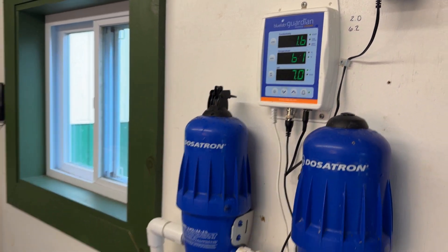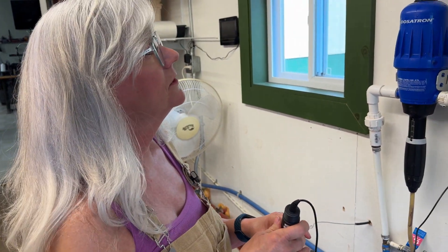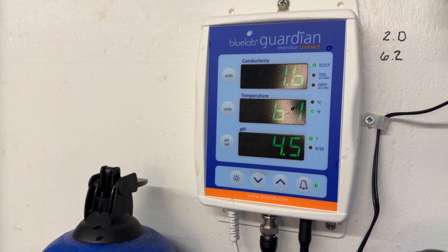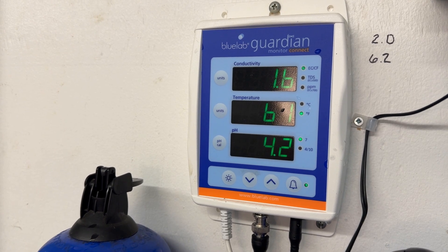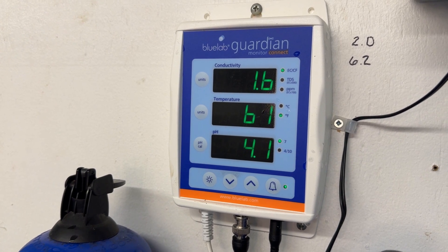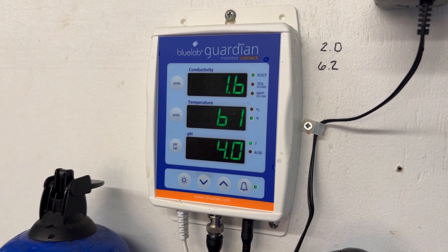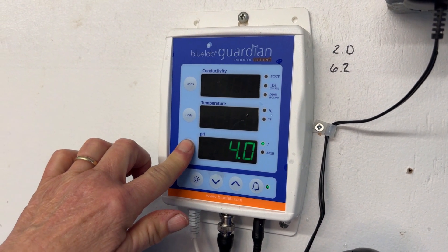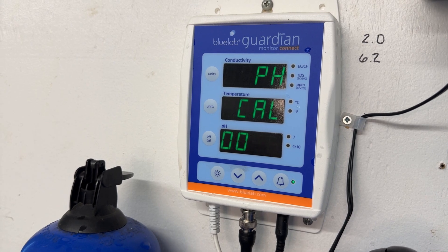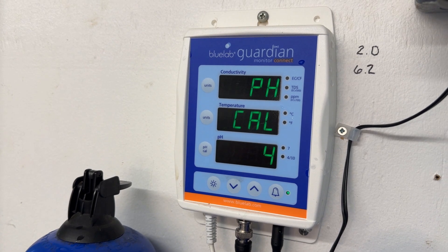Now you have to rinse the probe again in fresh water and do the 4.0 calibration. Put it in the 4.0 solution and wait for the number to stabilize. Hopefully it gets close to 4. That's pretty close. That looks good. Stabilized. Give it a second. pH Cal. Calculation. Yes, we're good to go.